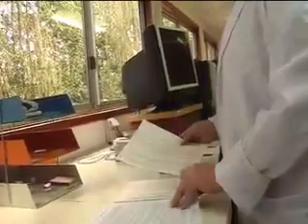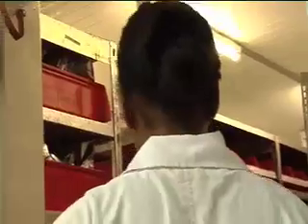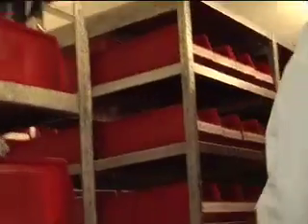The request goes from me to Uruguay. The next step is to use the list of accessions that should have the location of the seeds in the gene bank, the identification of the cold room, the number of the shelf, and the box within the shelf to locate the seeds.